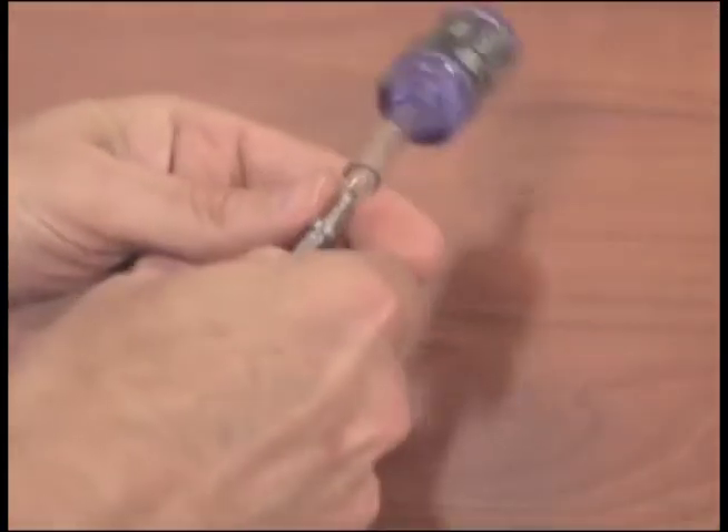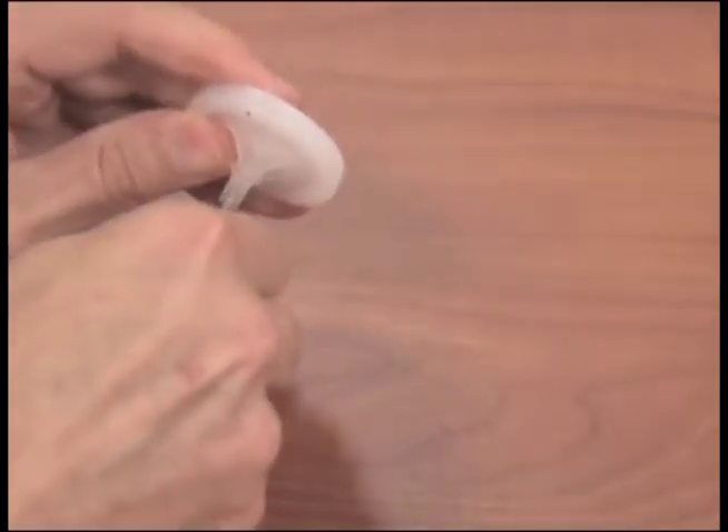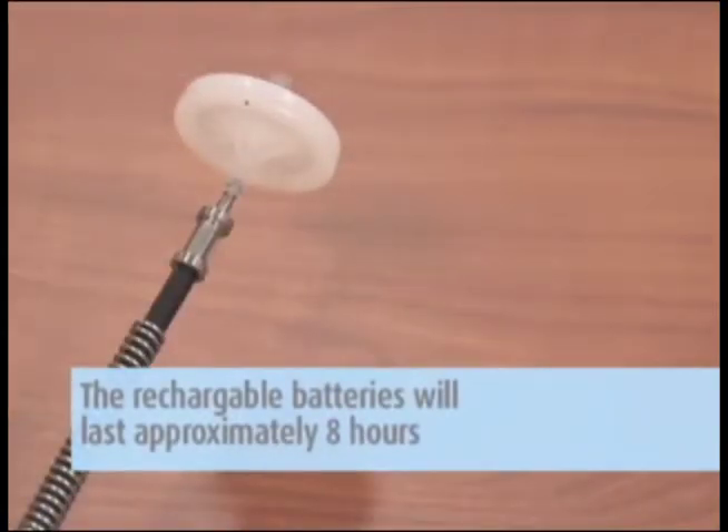Remove the zero carbon filter and install the water trap filter. You can now move from sampling point to sampling point to collect your data. The rechargeable batteries will last approximately eight hours before re-charging is necessary.